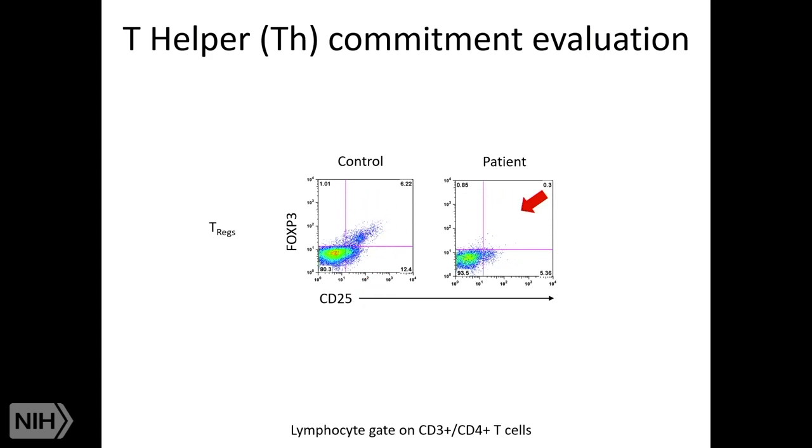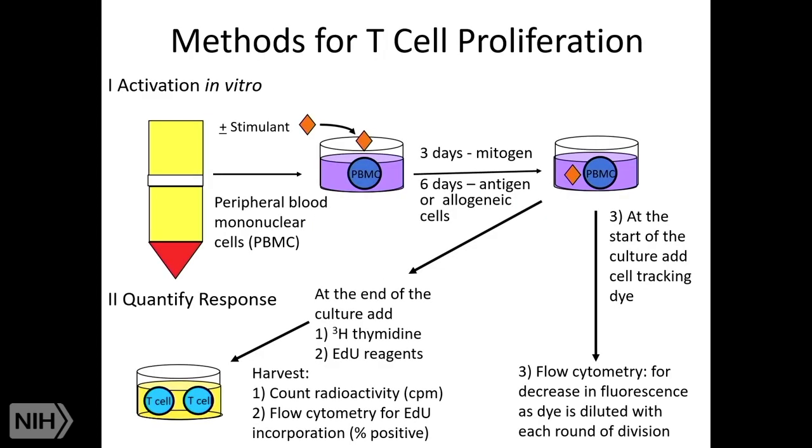If you are an IPEX patient, you may be negative for those markers. And this is the ideal case. It's not always that clear, but for a presentation, you look for clear-cut patients.